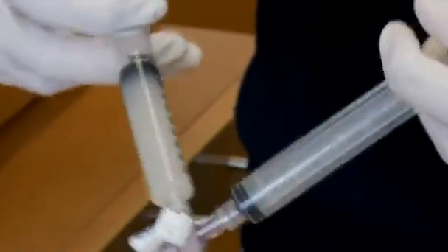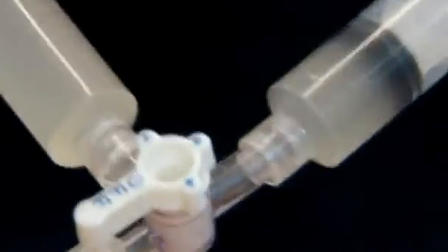One of the nice things about this technology is that it really doesn't care where the cells come from. We can mold or print cells of any type, whether they're ear cells or stem cells from whatever source. And there's the possibility of mixing them. We might be able to use just a few ear cartilage cells and stem cells and have the two populations communicate. So it's really unclear what will be the perfect population for the ultimate clinical use, but the technology that we've developed will be able to interface with whatever cell technology is seen in the future.